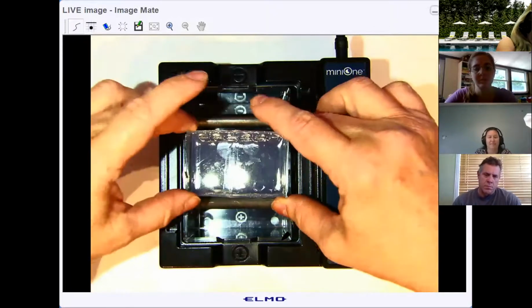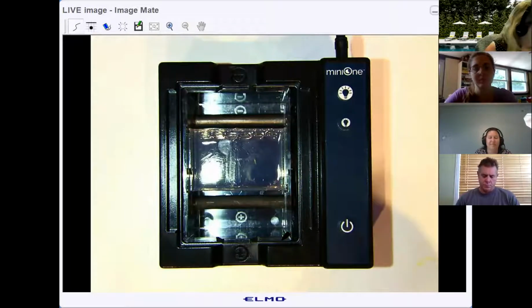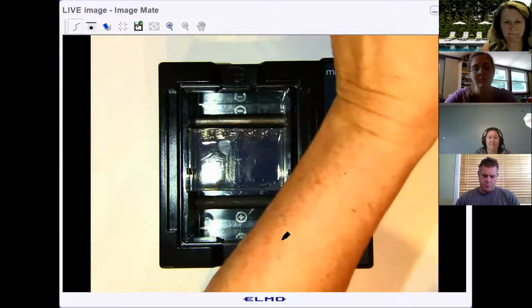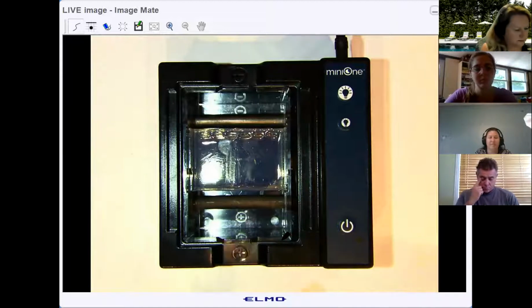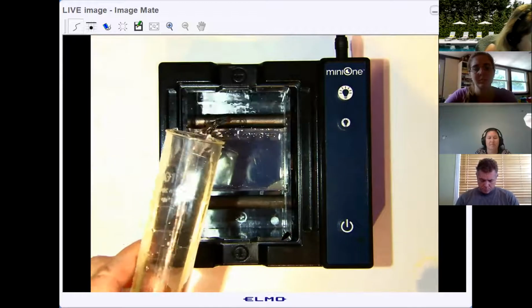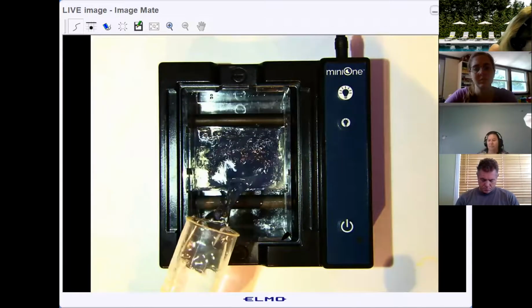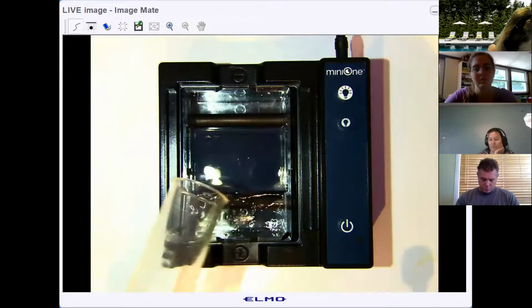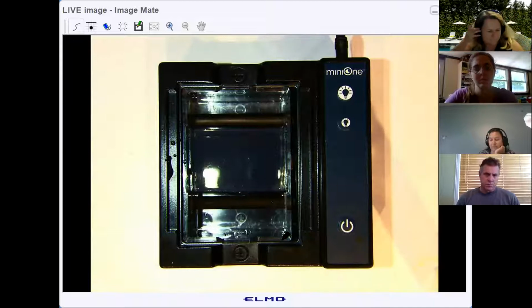Okay, so I'm gonna take this gel. I'm gonna pop it here in the chamber. It just goes right on top of that. And then I take my buffer that I just diluted up with distilled water. And for these biotech labs, for running the gels and doing bacterial transformation, you definitely want to use distilled water for that. And I think I need a little bit more buffer. Excuse me for a second. I'm gonna make up a little bit more buffer for that.